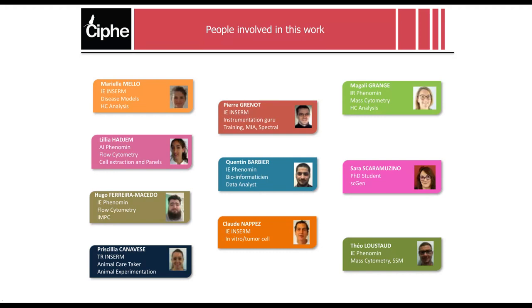But I had really no issues getting this extra money, because the managers of the funds understood very well the advantage of having a Cytobank platform to share data through the consortium.